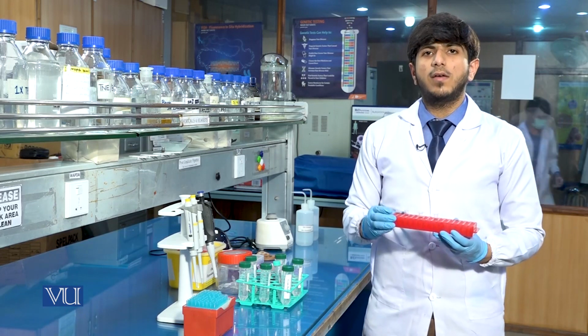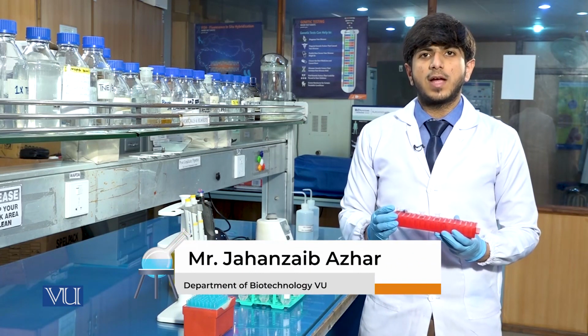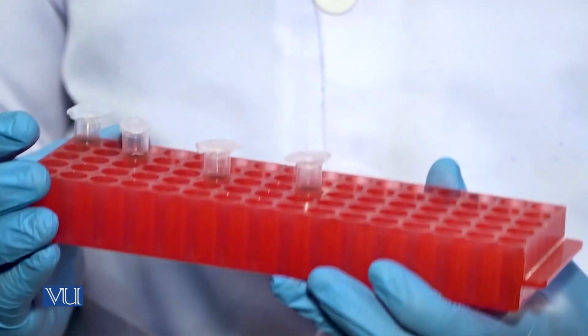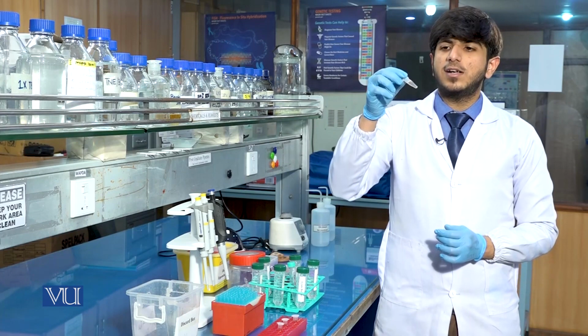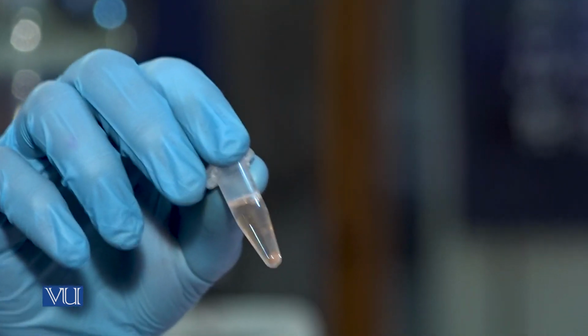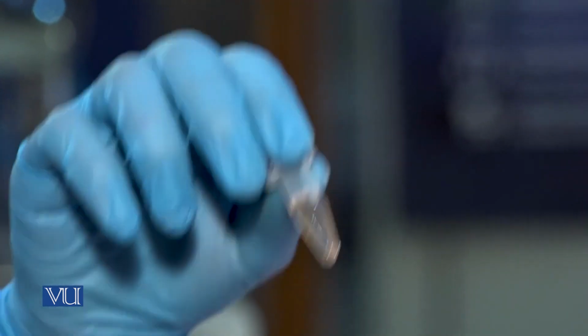After the addition of 1000 microliter lysis buffer, we will again move to the centrifuge machine and will centrifuge the samples for 15 minutes at 13,000 rpm at 4 degrees Celsius. After the second washing, the results will be like this. You can see the pellet has become somewhat colorless, but we will again do the third washing until the pellet will become totally colorless.